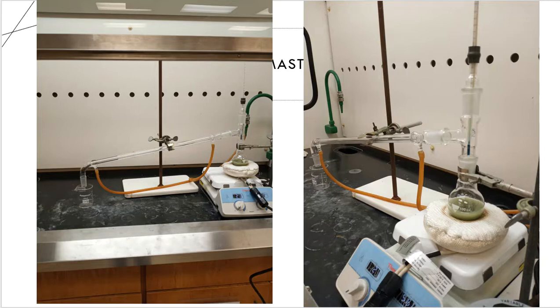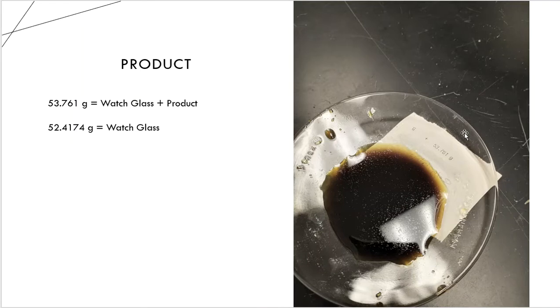And then finally, after that distillation took place, this is what we ended up with on the watch glass. So this is the product that has formed now from the reaction. This is typically what we do see after that distillation takes place. It's more of a dark, burnt, caramelly color, very dark brown. It has the odor of Play-Doh. That is what it reminds me of. And this is typically what we see every time that we do this lab. So I felt much better about this particular product.